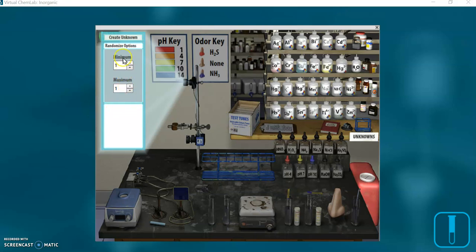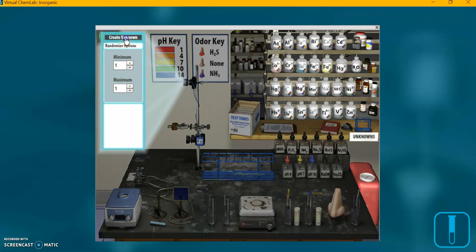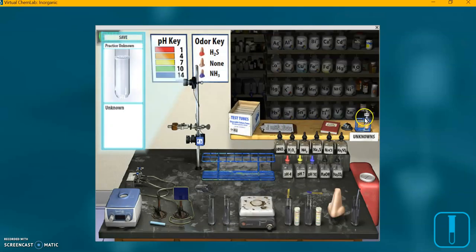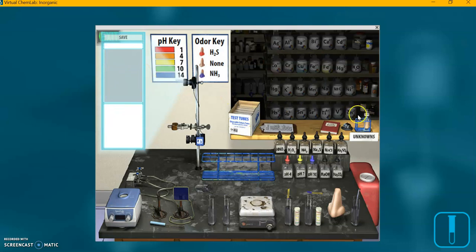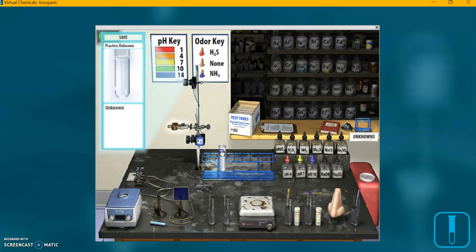Now over here, do not change the minimum or maximum figures. Just click this little button up here, create unknown. And look, right there, we've got an unknown. When I mouse over it, you can see over here on this window, it tells you, it says practice unknown. I'm going to drag that thing over to our test tube rack.